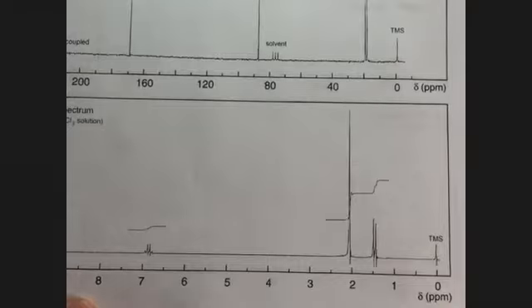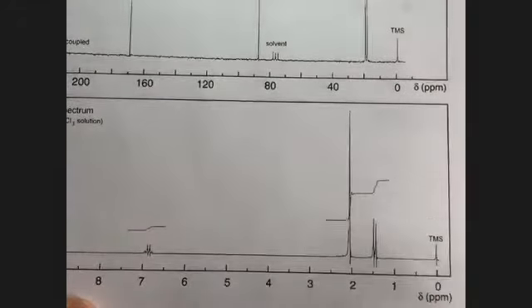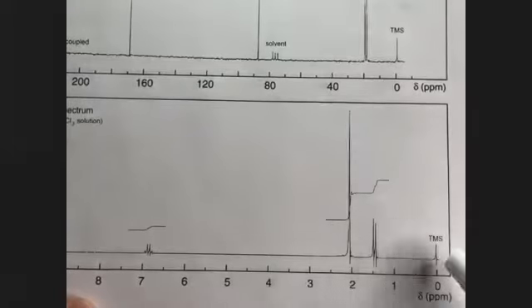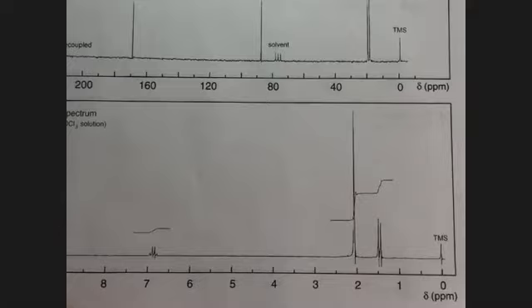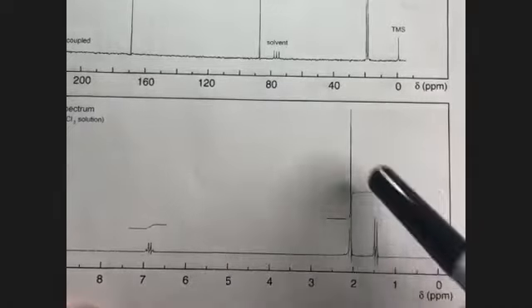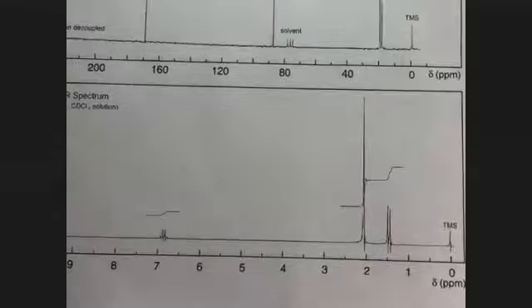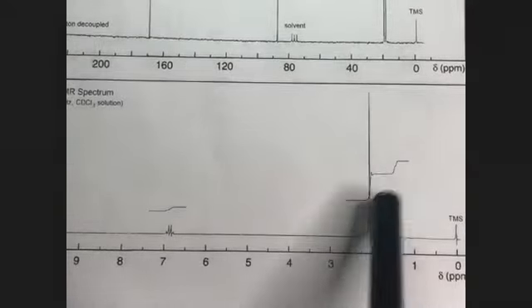It's hard to tell, but again, you use the fragments that are clear, which is like the singlet and the doublet here. And notice that this signal intensity is much higher than this one. So what you would actually have to do if you were given this on an exam is measure these lines here, that this is the integration lines, and then you could determine how many hydrogens are there. This would be done for you, but I just pulled this example out, so I haven't done this, but you can notice that this is about twice as big as that.